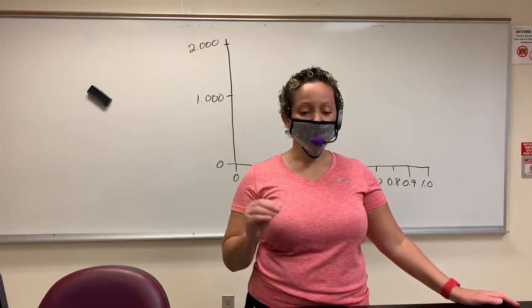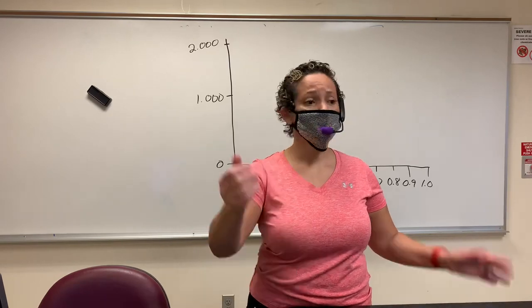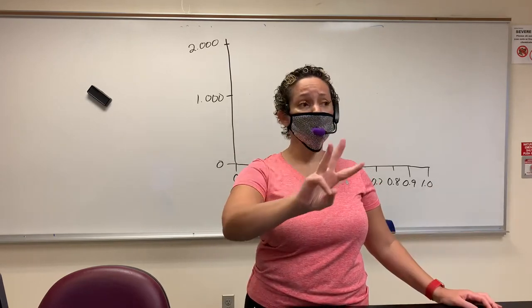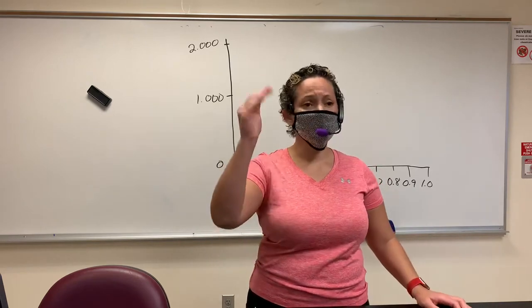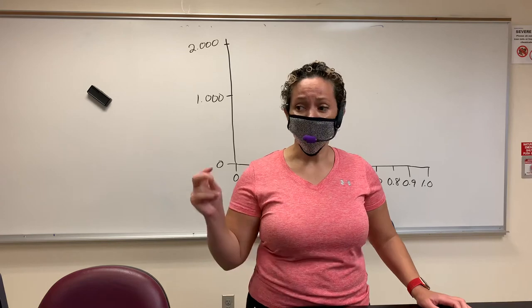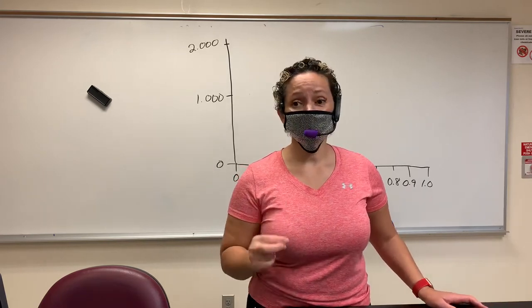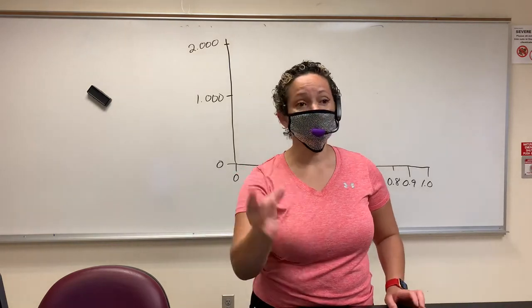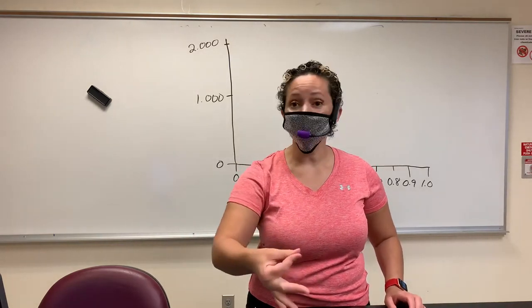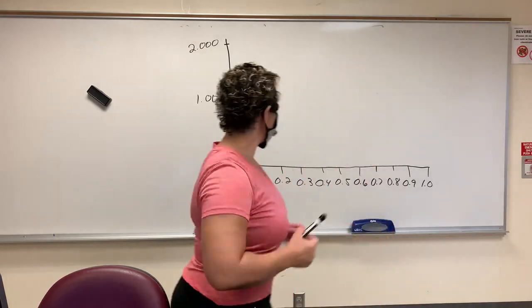And so what you're going to do is plot the known things. Remember, you had to do 3 unknowns, and you're like, what's that about? I'm about to tell you. But you had a whole list of known molarities. You know what those molarities are because you took a lot of time to actually make them. You made a 0.1 molar solution, a 0.2 molar solution, a 0.3 molar solution. Am I right? So those are known values. So you go ahead and plot those.